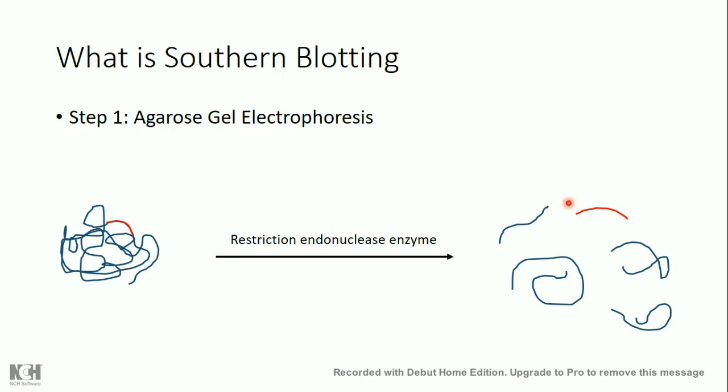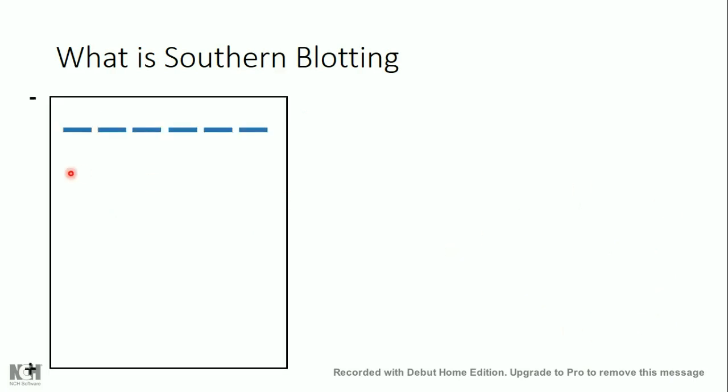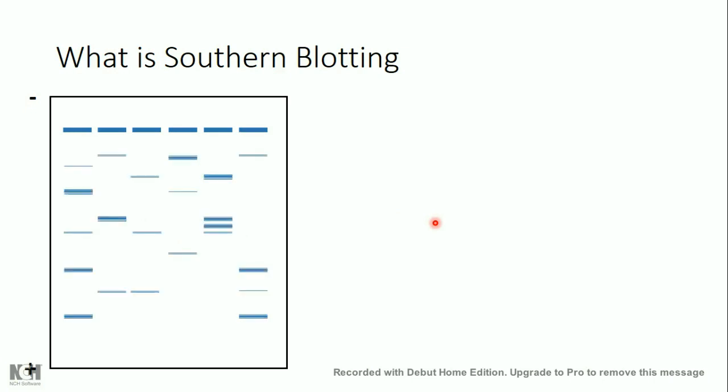After digesting the DNA or the genome, I apply this sample on the agarose gel, using an electrical current. Then the DNAs will be separated. Of course, I might have several samples, and the DNA sequences will be separated according to their length.